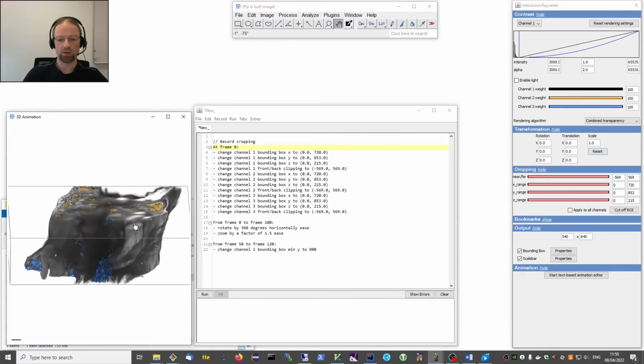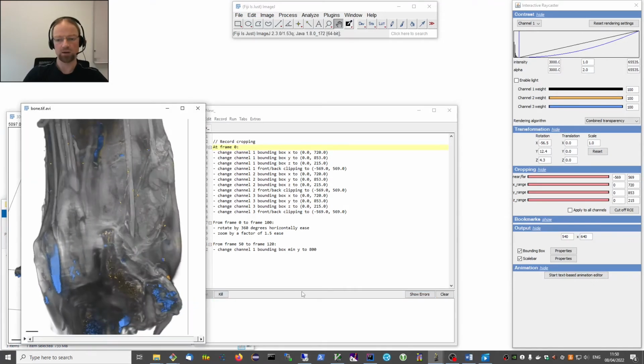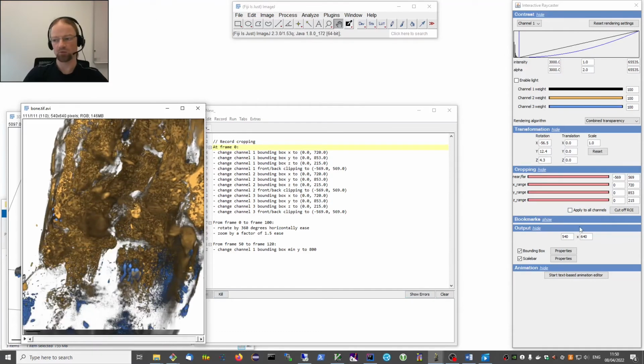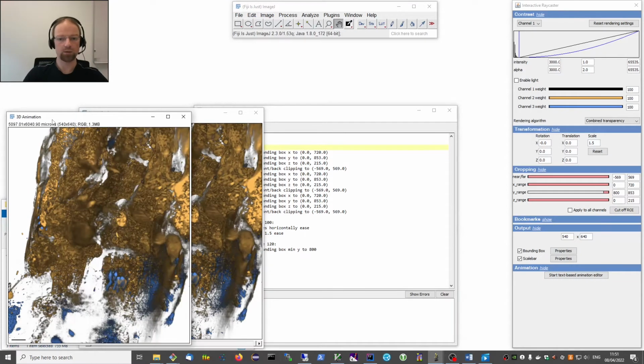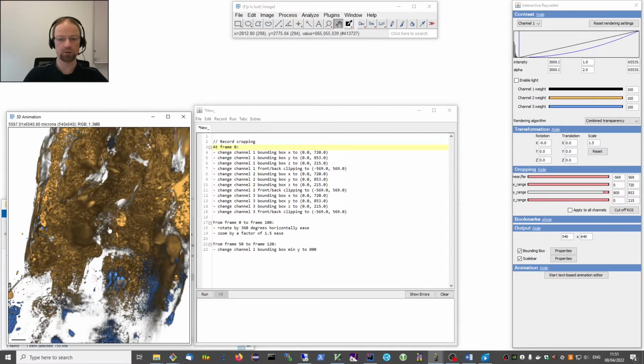What if I want to have the object rotate with this starting orientation? So can I just do it? I click run. No. So it always starts from basically the untransformed object. So that's different from all the other numbers that you animate. The transformation always starts from the identity, no matter what there is in the user interface or at the preview. So how can I still use some different starting position? I will of course show you.